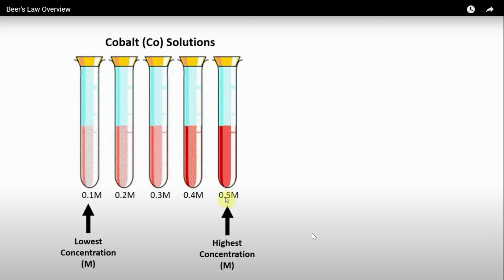How do I know how much solute to put in? You would need to use the molar mass. I've got my volume and my molarity, I would find moles, then grams, then weigh it out and put it in here. Sounding familiar? Don't worry, we're going to do this again this year, so you get practical hands-on experience.